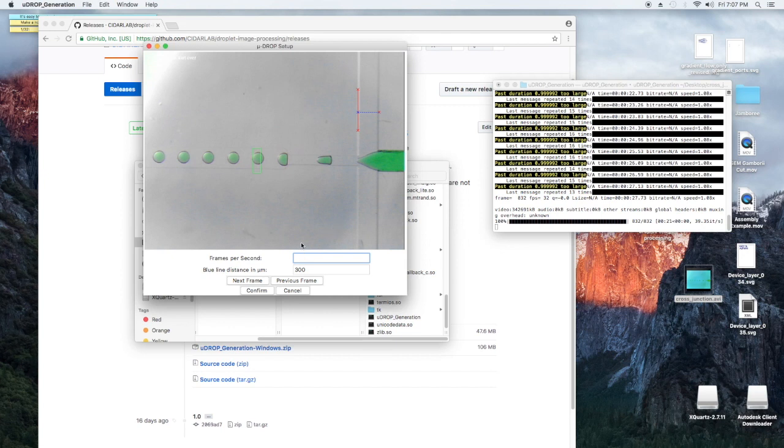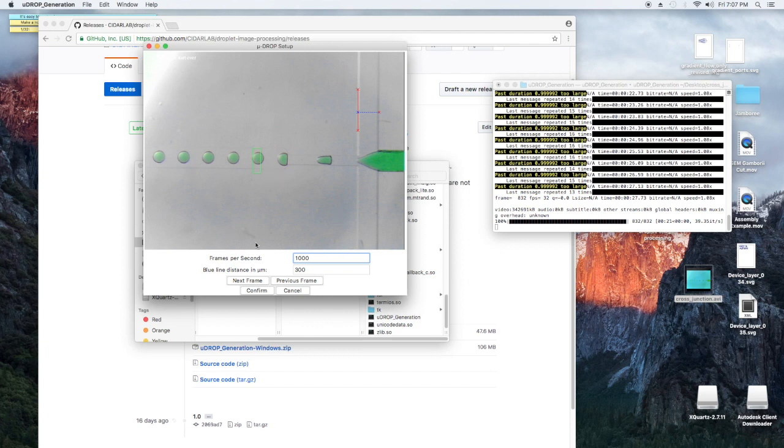And next we're going to give it the frames per second, because you want your droplet generation rate in seconds, not in frames. So you're going to need to give it the frames per second, again, so you can get a real measurement from this. Now we're going to hit confirm.